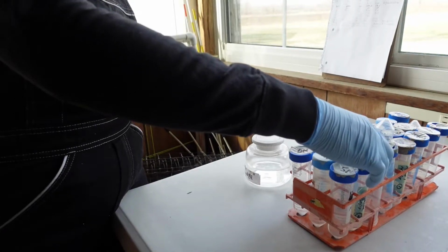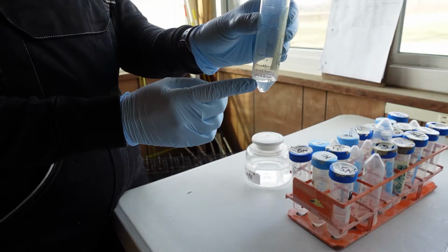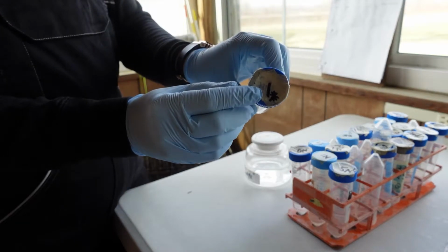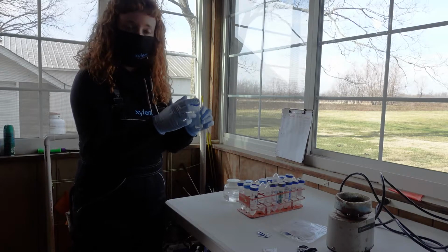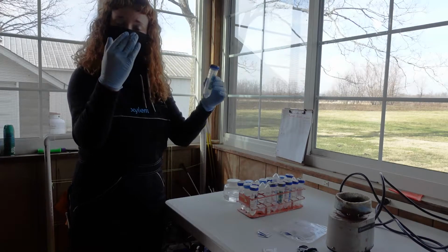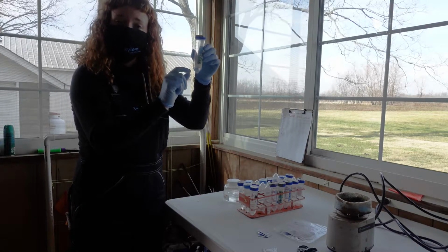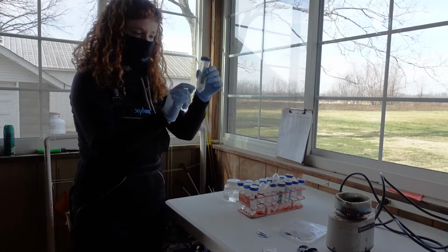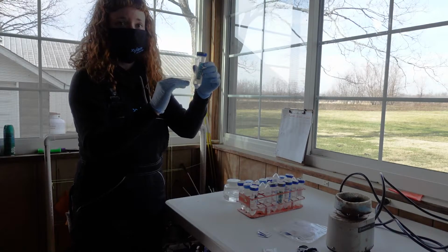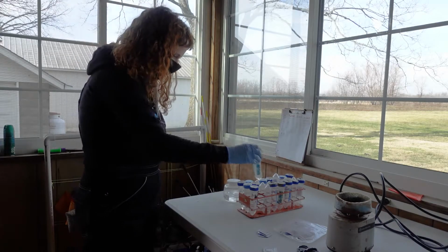And then the last kind of label you will see, this one won't be empty. It'll have a couple milliliters of standard in it, and it will say a number and then a star. That means 1 spike. So what this means is that before you've come in for the day, the tube has been given a spike of a reagent, of a known concentration of nitrate. And then what you will do is add sample number 1 to that reagent. We'll show you what that looks like.